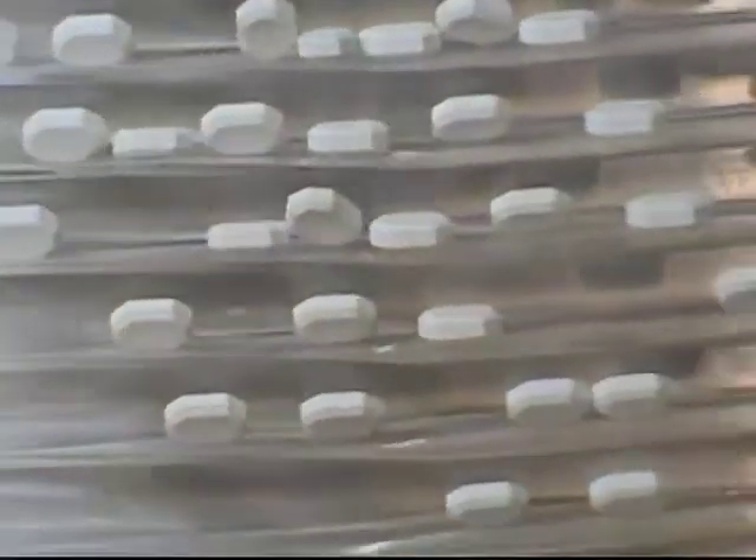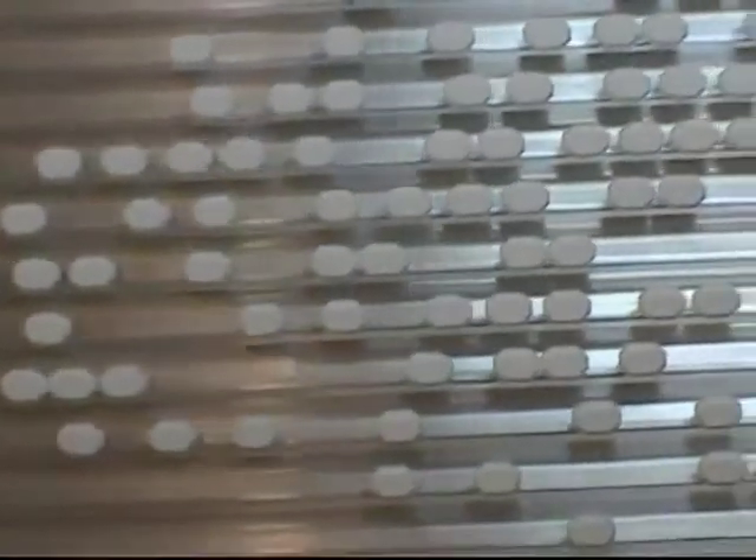In addition to the clear acrylic table that is shown here, we also offer a solid white polypropylene table. The tables have 15 channels and the machine can handle up to 60,000 tablets an hour.